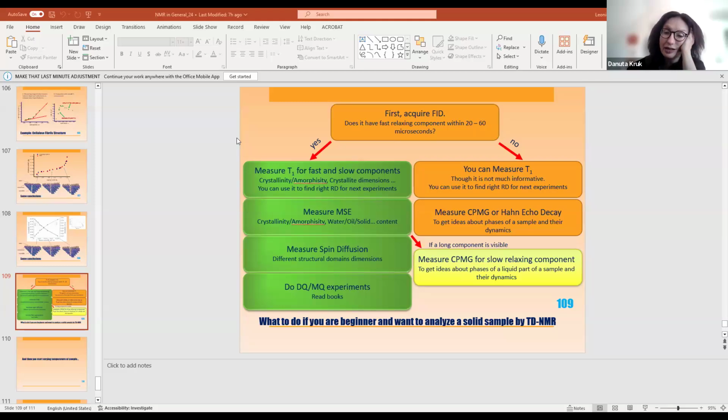Adriana is writing something I do not understand. Also, in high field, the sample has two different environments. What do you mean by two different environments? And why does the environment depend on the magnetic field? What do you mean, Adriana, by environment? Maybe the environment stimulates or prevents the motion.